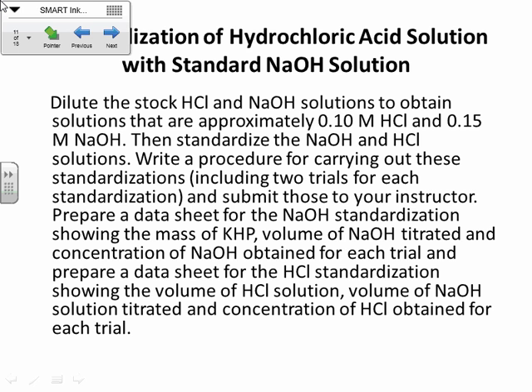Plus, it's easier to dilute the HCl than it is to measure out the KHP, so you don't have to worry about that step anymore. Like I said, we'll just see how far we get, and then play it by ear from there. I want you to go ahead and do this whole lab, though, because this is your first introduction to titration, and I need to make sure that you know how to do this right. So we'll take as long as it takes, I suppose.